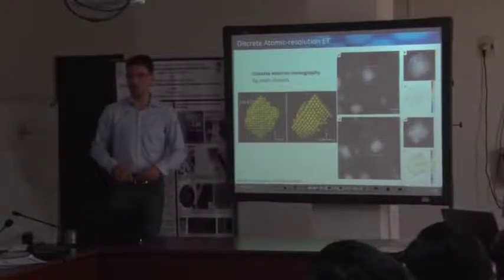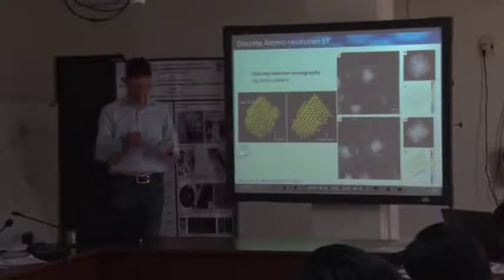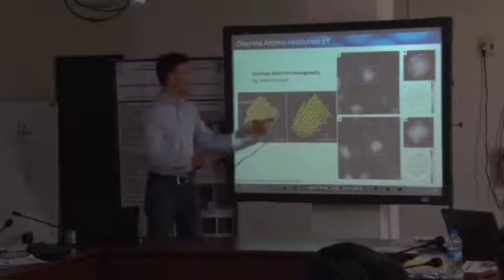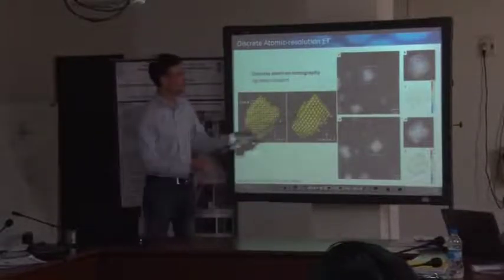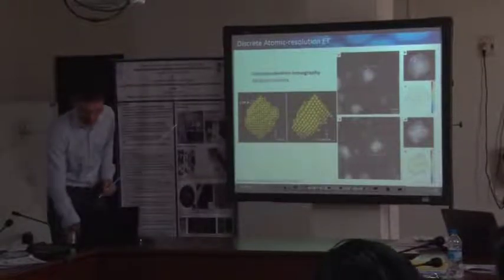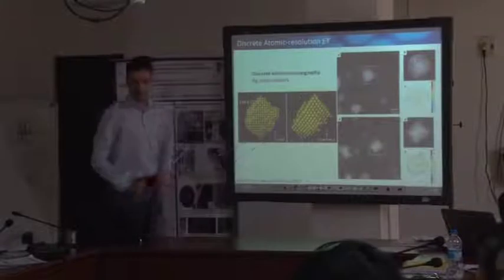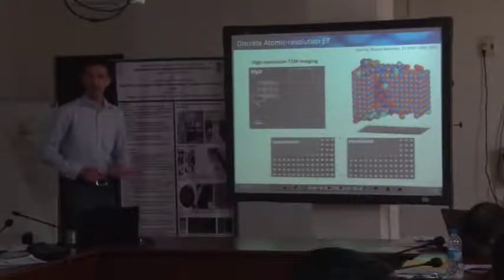So this is clear. This is like stereo microscopy. In principle, you only need two directions, and from that you are able to use these local numbers of atoms to calculate the three-dimensional distribution of all your atoms within such a precipitate. This is called discrete electron tomography. This is STEM imaging, because here you can directly relate the local intensity. But this can be done as well by atomic resolution, like high resolution TEM imaging.